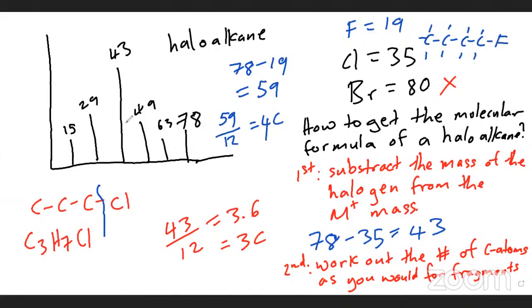All right, so the question now is, if this is the structure, what is going to tell us if it is correct is if this structure can match the fragments here. The 63 and the 49, does it align with this structure? So can we get 63? I'm seeing some messages. It's 4 carbon, I believe. Yes, it's 4. All right.